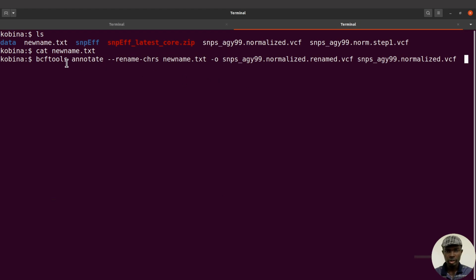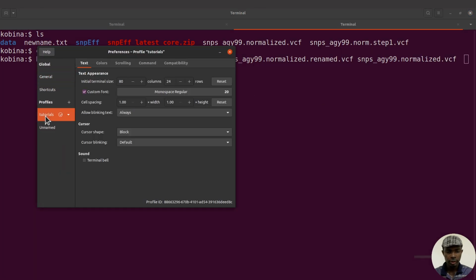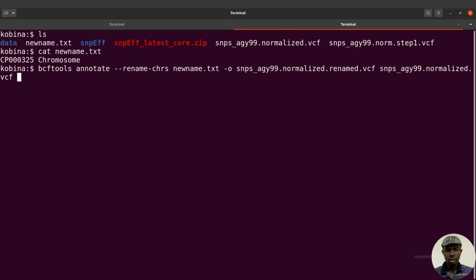Okay, so this becomes the final command to rename the chromosomes. All right, so that's what I thought I would let you know. So now we can execute this command. I'll revert back to the first slide. Okay, so now let's execute this command to rename the chromosomes.